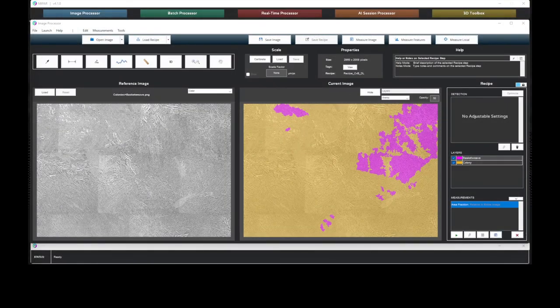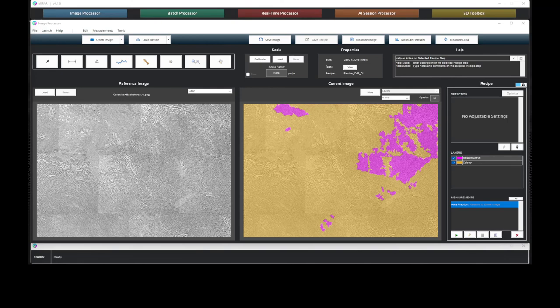The capabilities of detection and report generation are also available when processing batches of images.